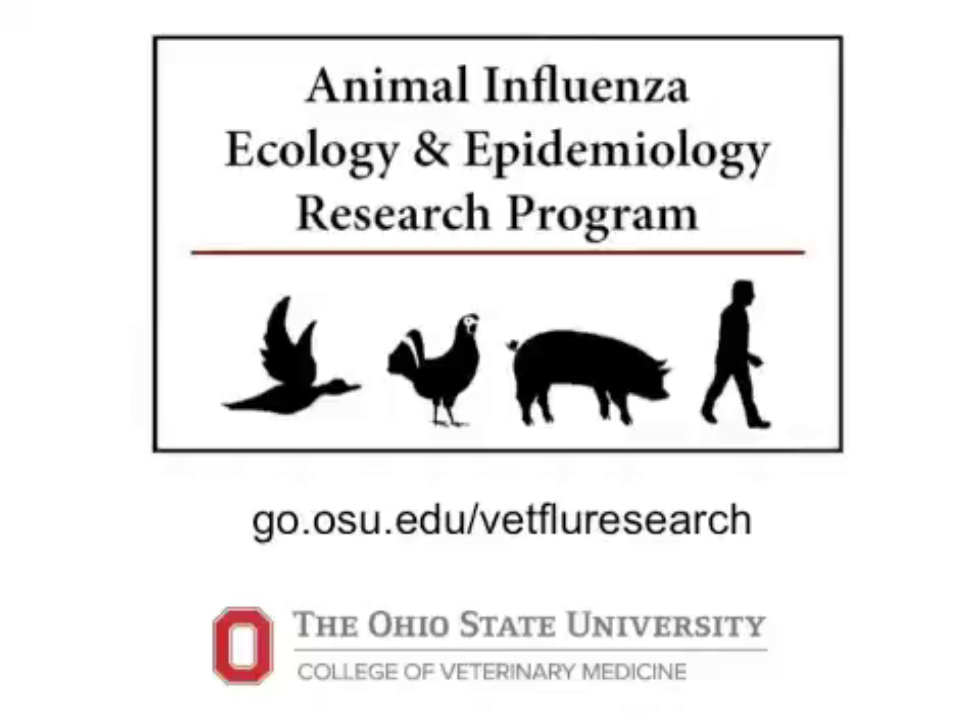Hello, I'm Jacqueline Nolting with the Ohio State University Department of Veterinary Preventive Medicine, and I'm here to share with you the proper technique for taking snout wipes for viral detection from pigs.